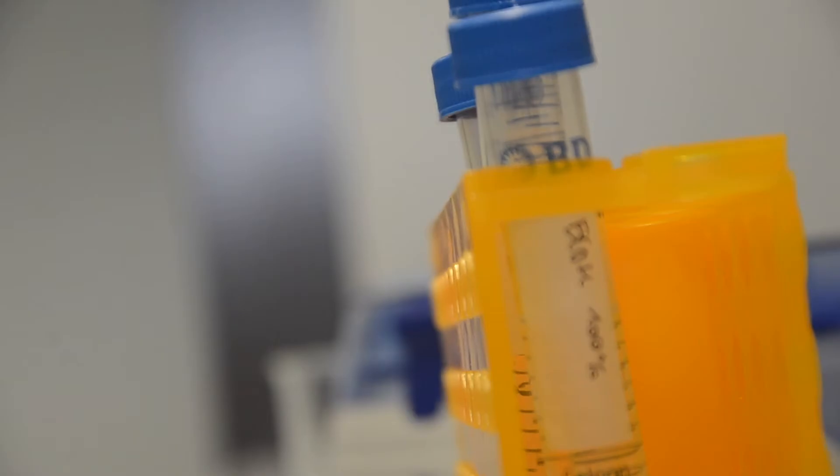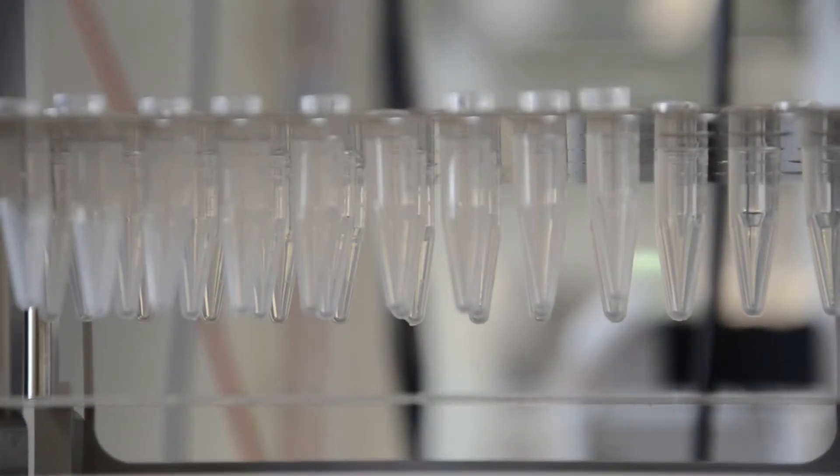After performing all the purification steps, we also wanted to be sure that our method was working, so we took samples during and before the purification. Using SDS-PAGE, we could show that our method was working quite well. We had a purified antibody after the final step.